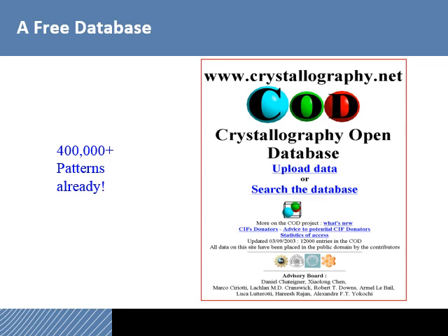But you certainly could use this database just to learn how to use or analyze XRD patterns and perform basic Rietveld refinements without spending the money. And for the most part, the mineralogical and inorganic portion of the database is really more than sufficient for doing basic analysis. So, a free option.